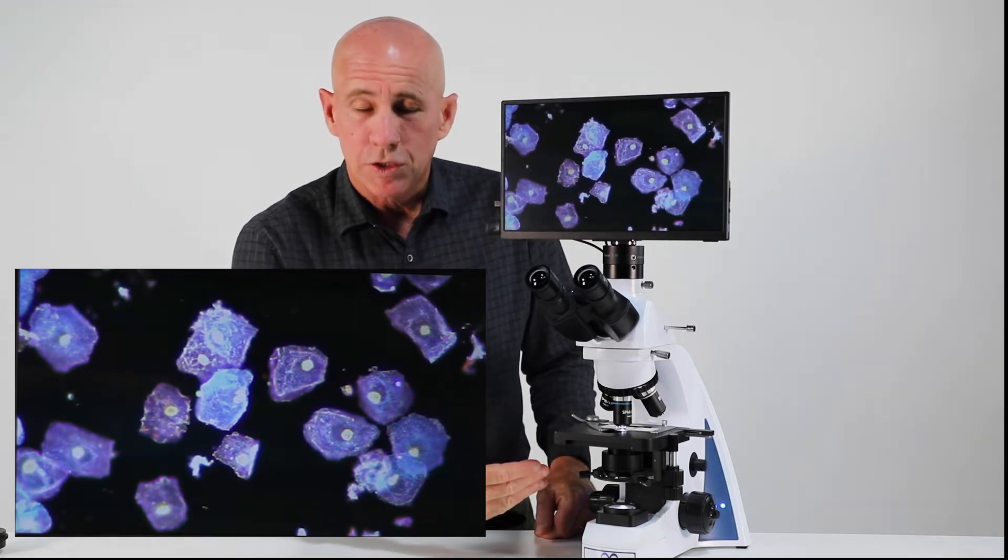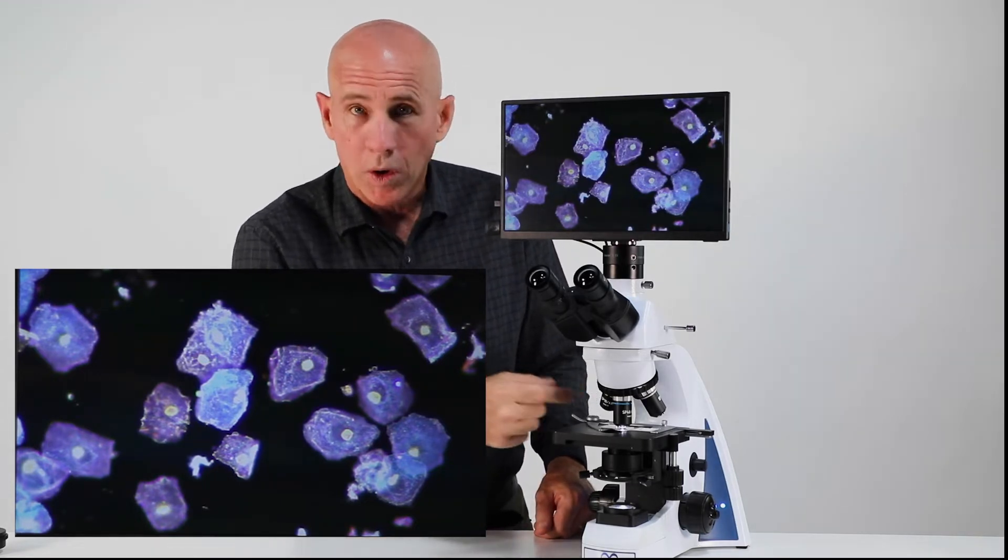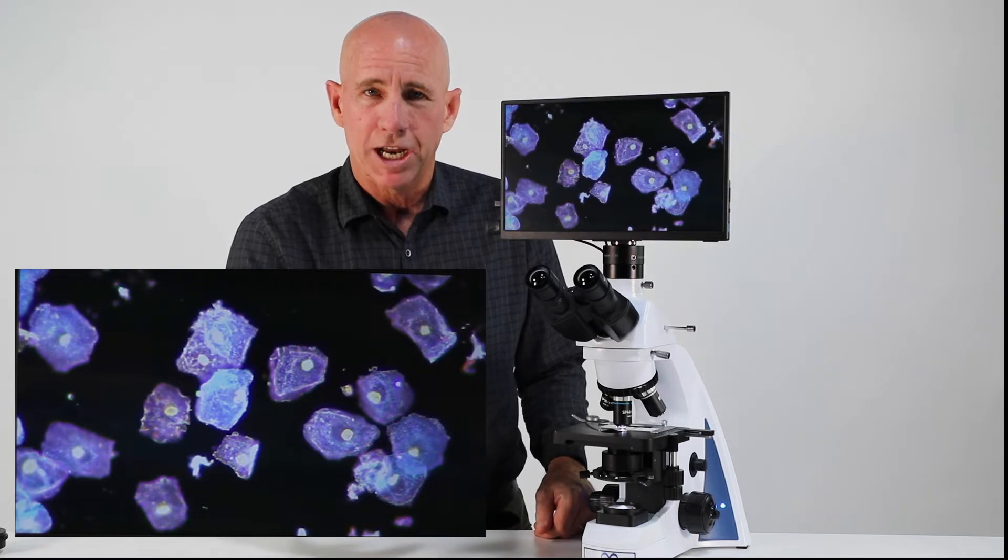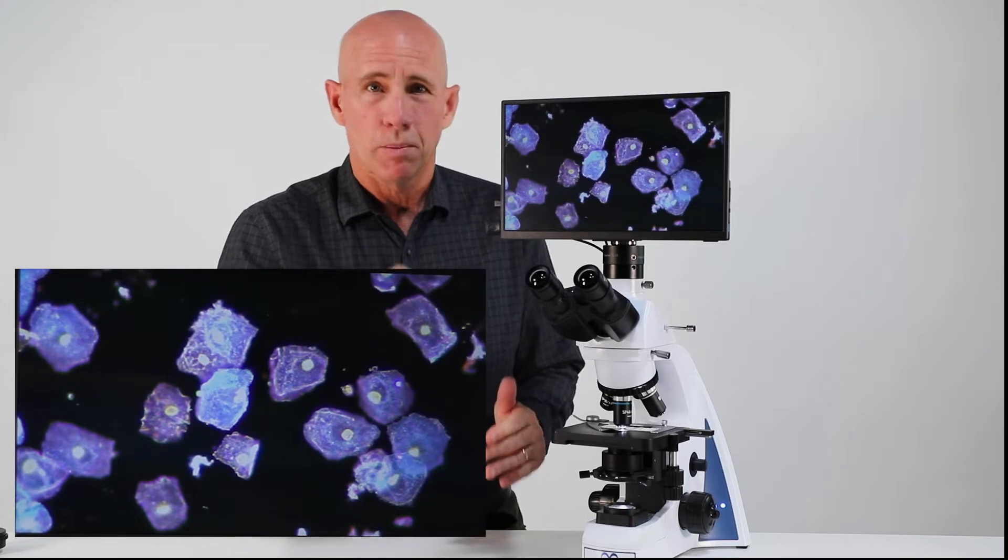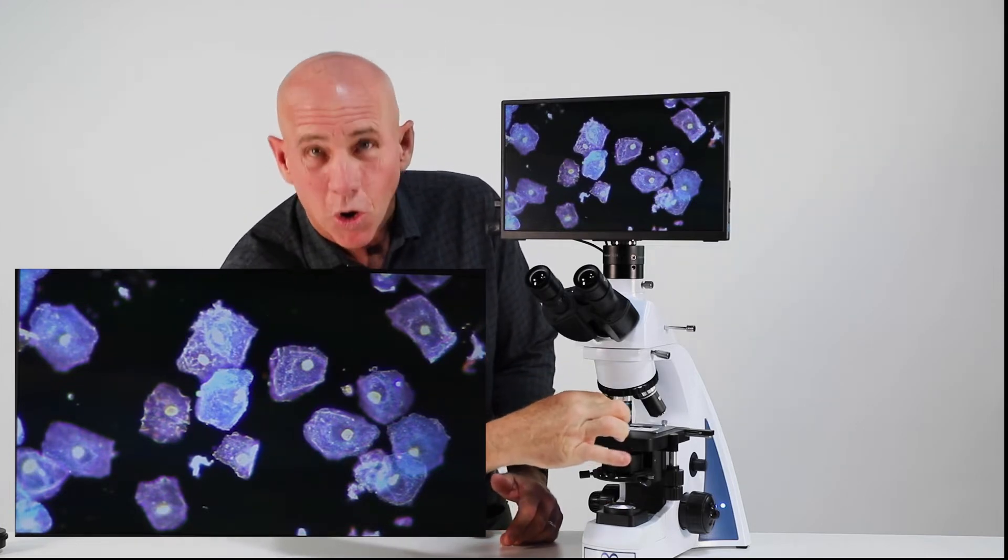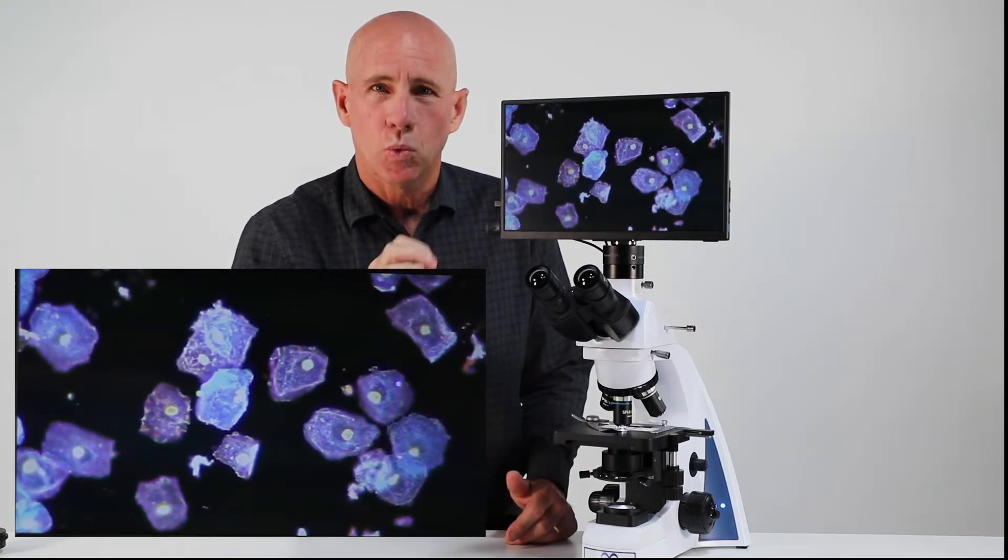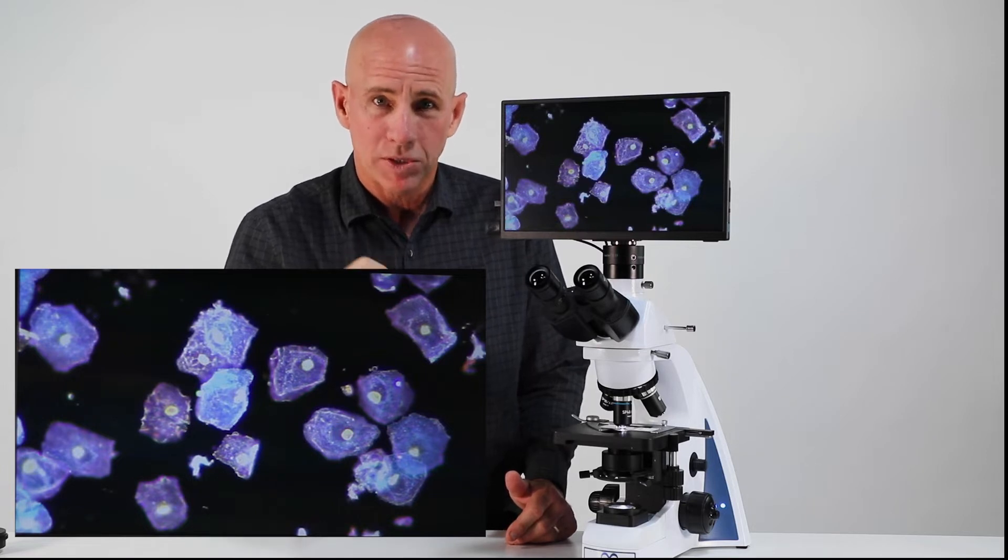Now the dark field is going to work well on a 4, 10, 40 objectives, even a 60X objective. You should be able to do dark field. Anything up to about an aperture, which is on the side of your objective, anything up to one, just under 1.0.